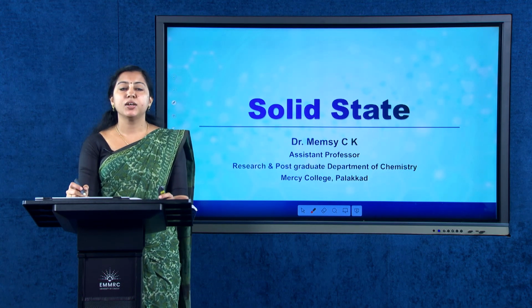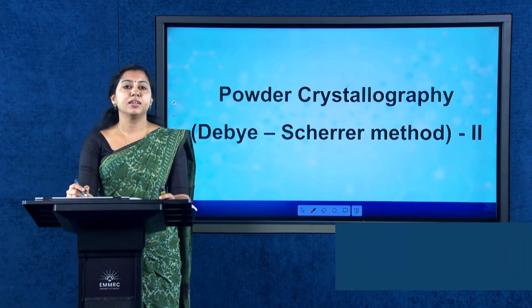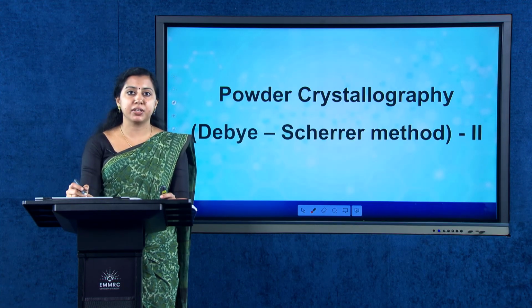Dear students, welcome back to the lecture series on solid state. In this session, we will continue our discussion on the powder X-ray diffraction method or the Debye-Scherrer method.